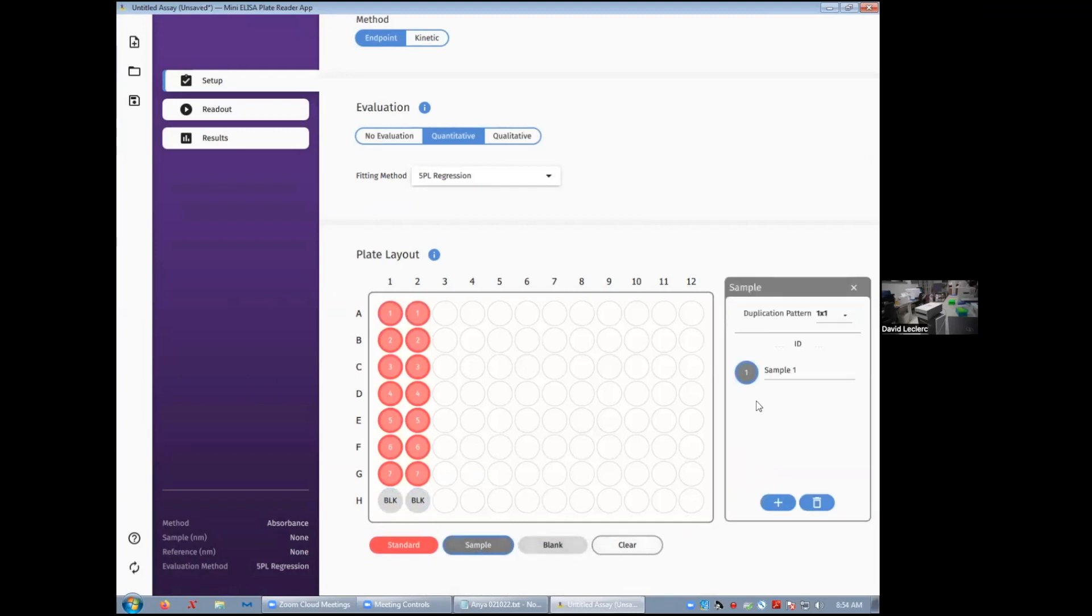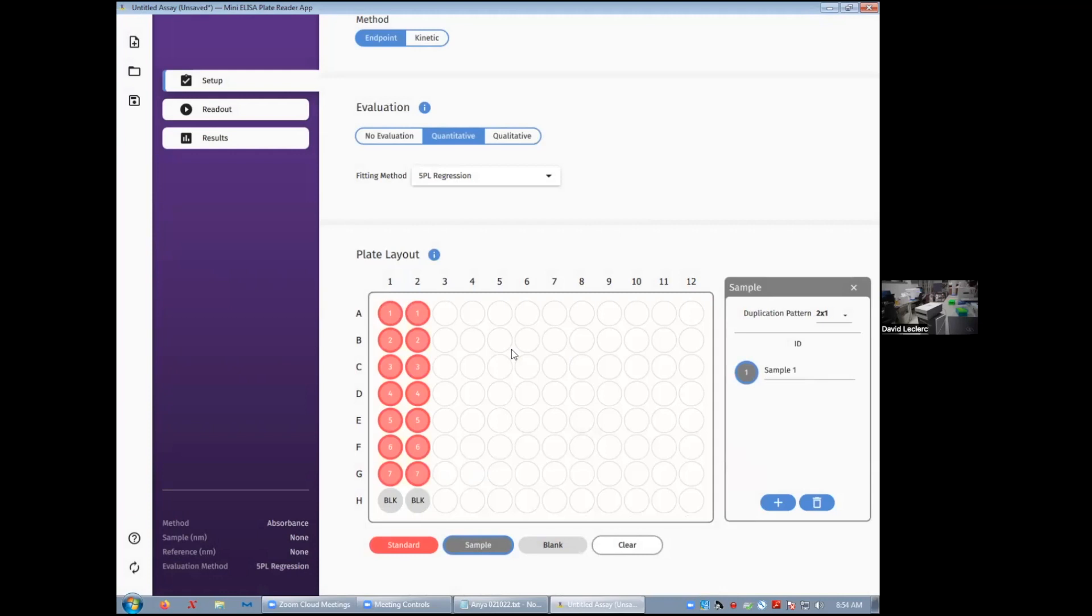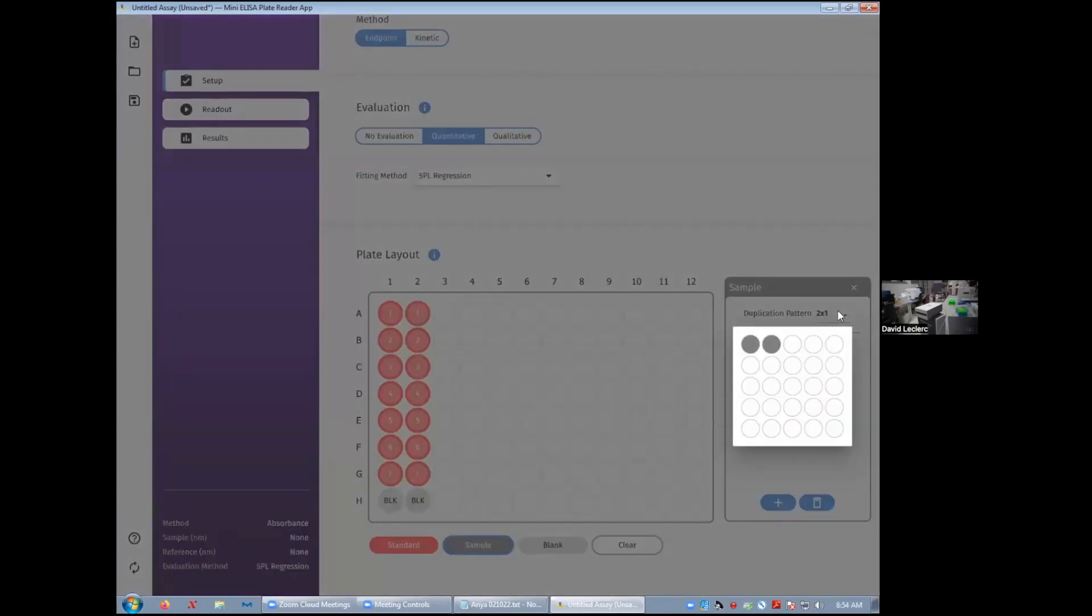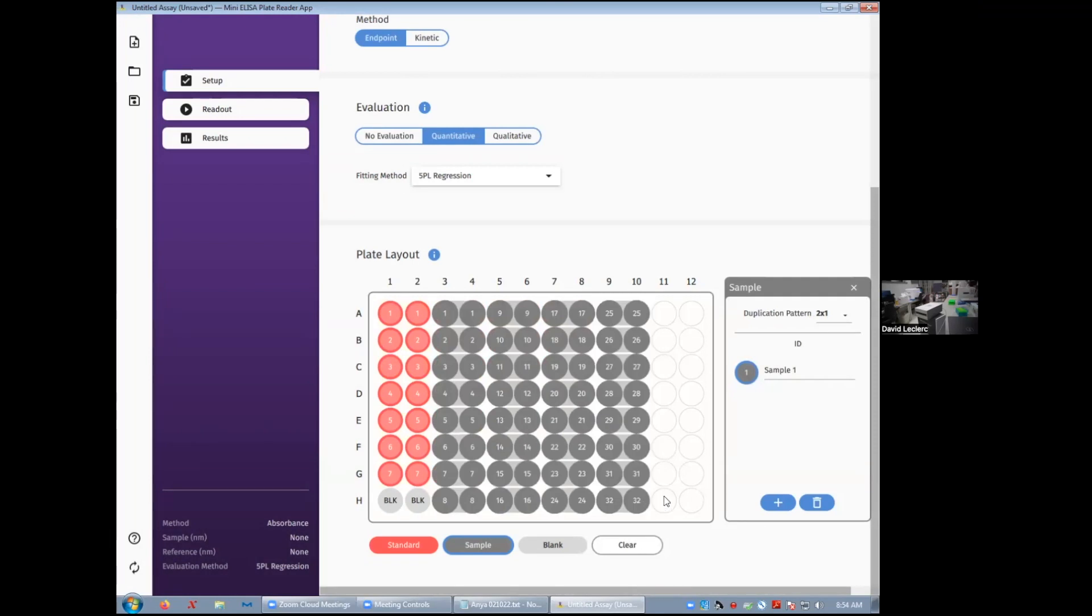Then my sample, same thing. Decide on your pattern of duplicates. There you go. And click away.